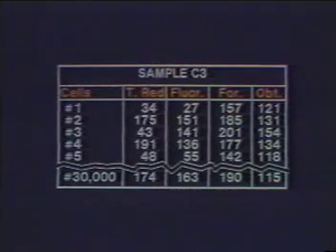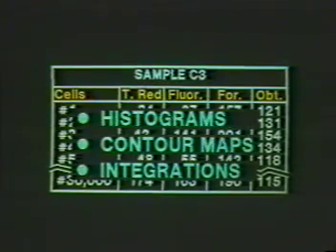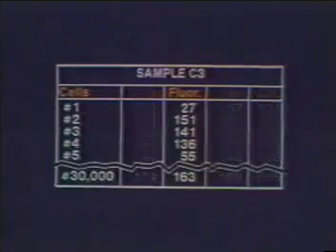Before we explain how to answer the secretary's prompts, let's explore the options FACSDesk offers for analyzing list mode data and discuss some basic data analysis strategies. Several variations of the analysis formats shown in Part 1 are available to you. To display single parameter distributions, you may choose between two different methods of generating histograms.